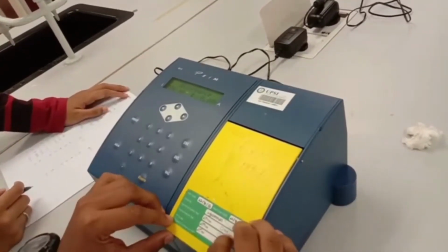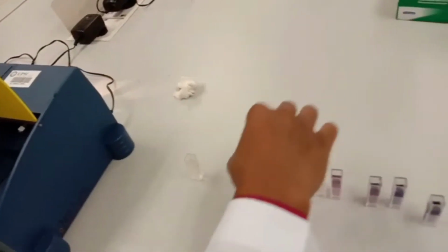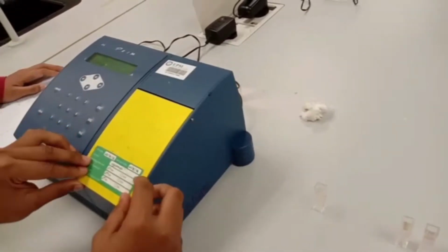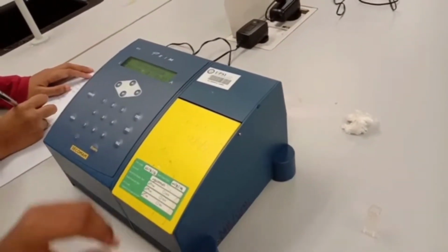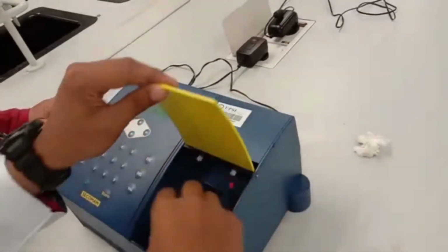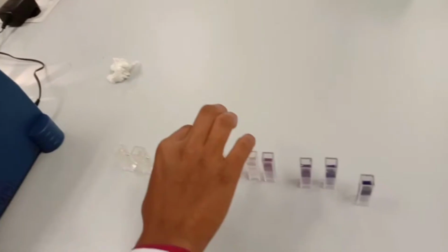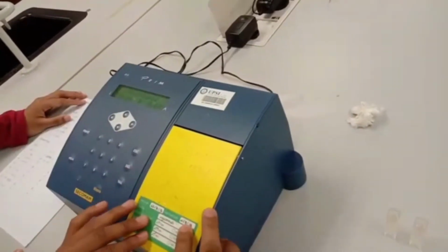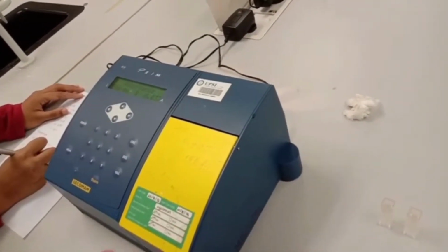Absorbance was measured at 590 nanometers. All of the solutions were measured continuously and the absorbance was recorded.